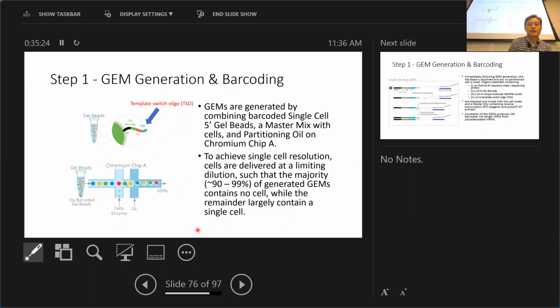As we know, this is a system for single cell barcoding. Remember, at the same time, you still have single cell RNA from the T cell, B cell. So we understand their barcoding system, their UMI barcode, their 10x Genomics barcode on the gel bead, and you know which cell the transcript is from.